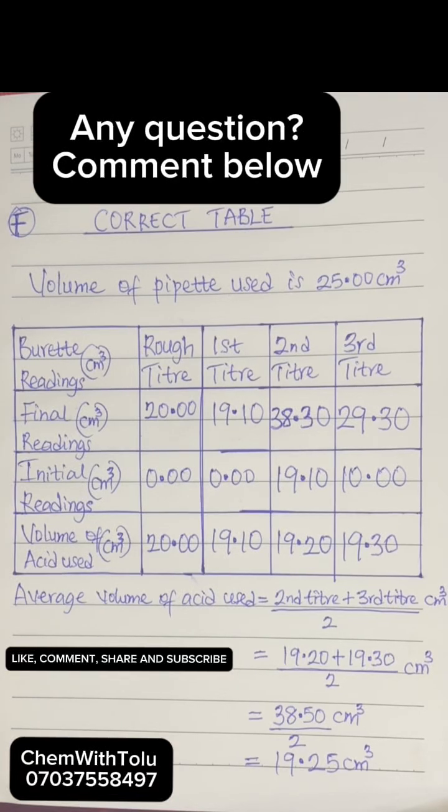Finished the topic on top 5 WAEC practical mistakes and how to avoid them. So I just decided to put this a correct table, how the table should look like.